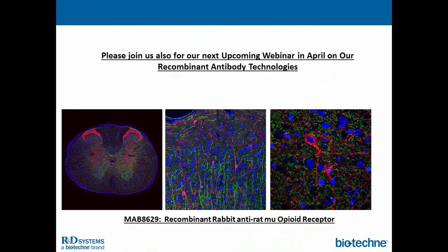This is one reason why we did partner up with Antibodypedia, and that will give us another data point on actual knockdown data that we would like to leverage more going forward. But that's a good question. So when you have a single application, you need to do additional testing to make sure it is specific.